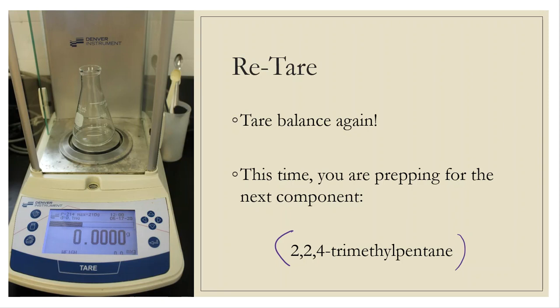So it told me specifically to do the mass of the first one. Why didn't it tell me to do the mass of the second one? Well, I just want to make sure that I don't need it. So what I do is I re-tare it.